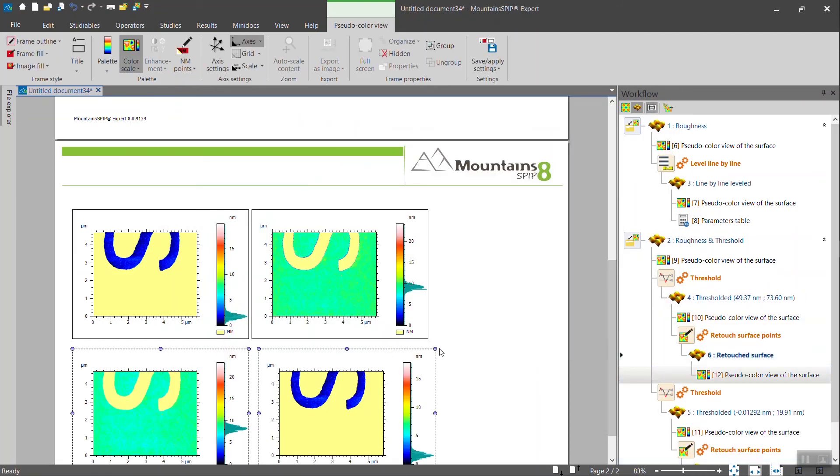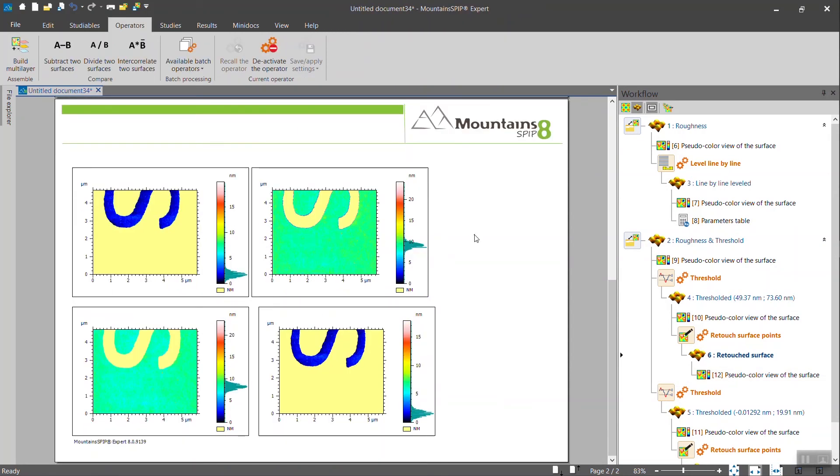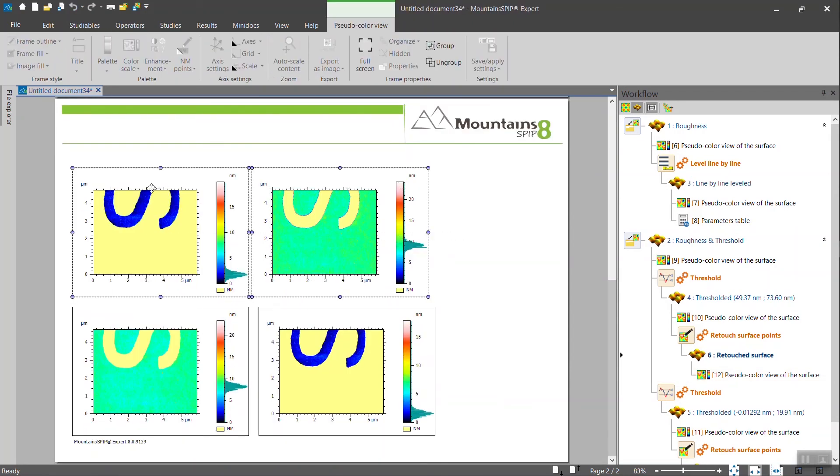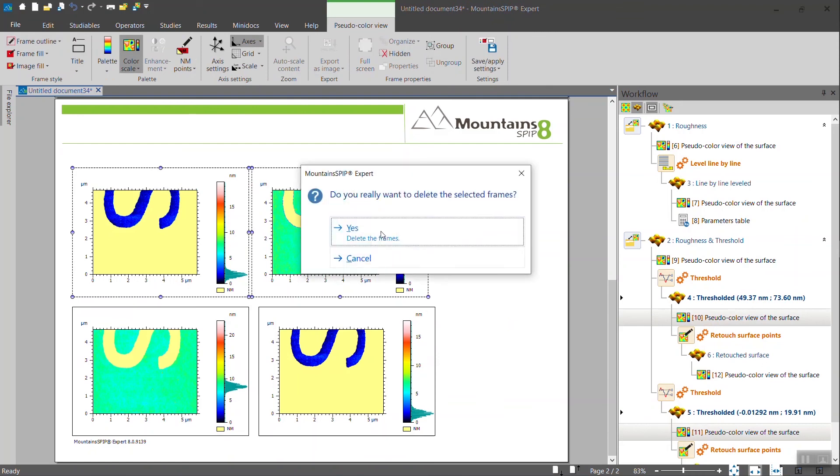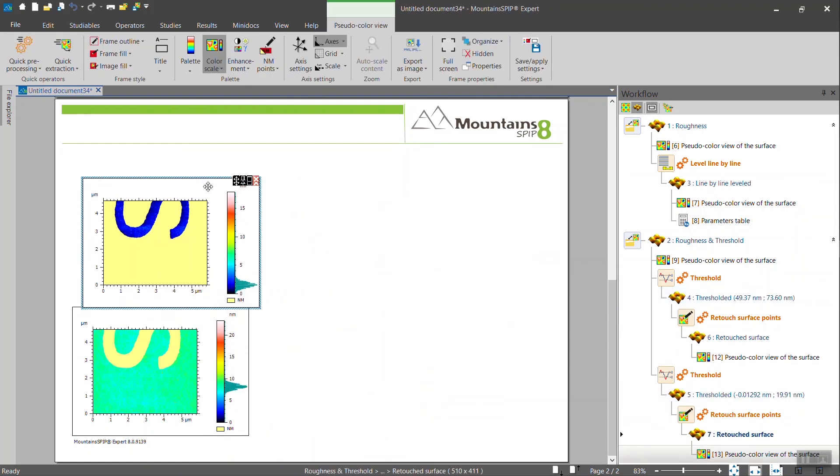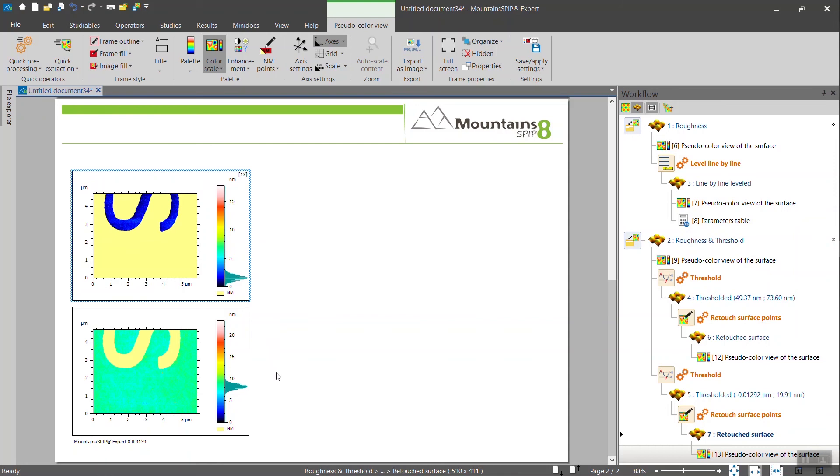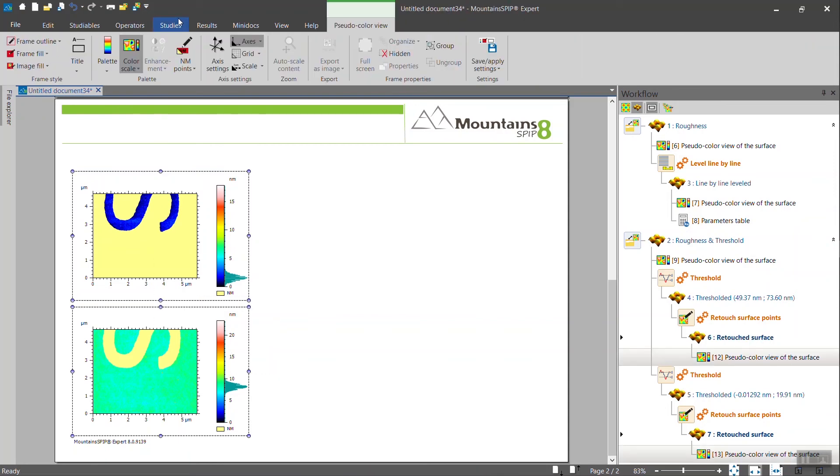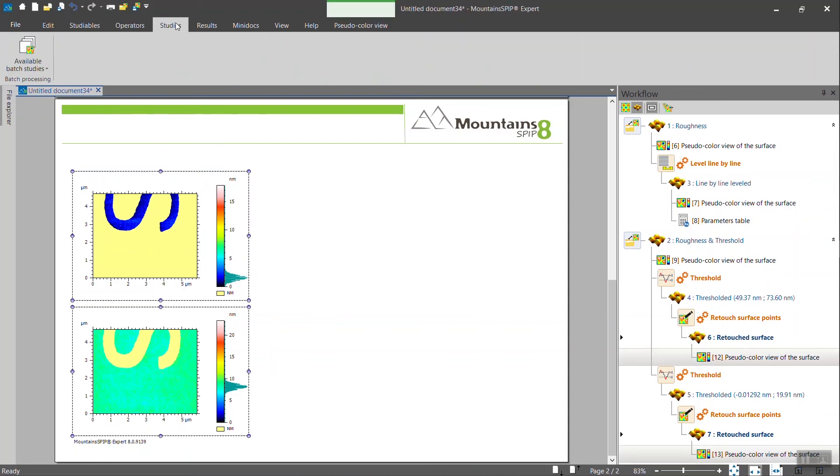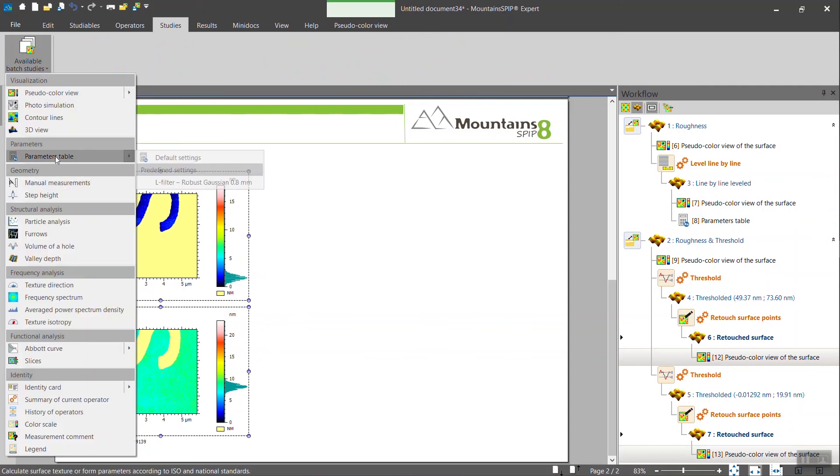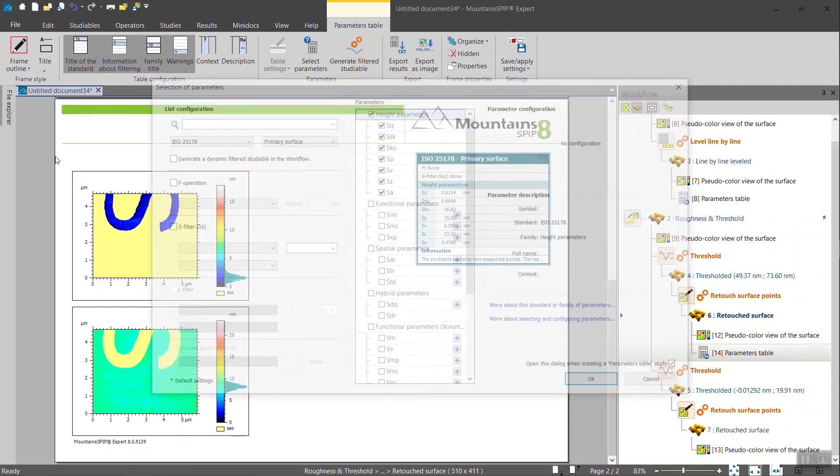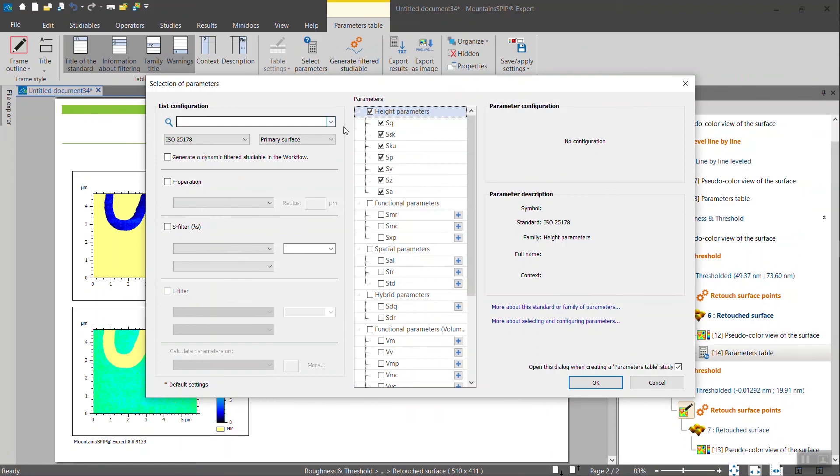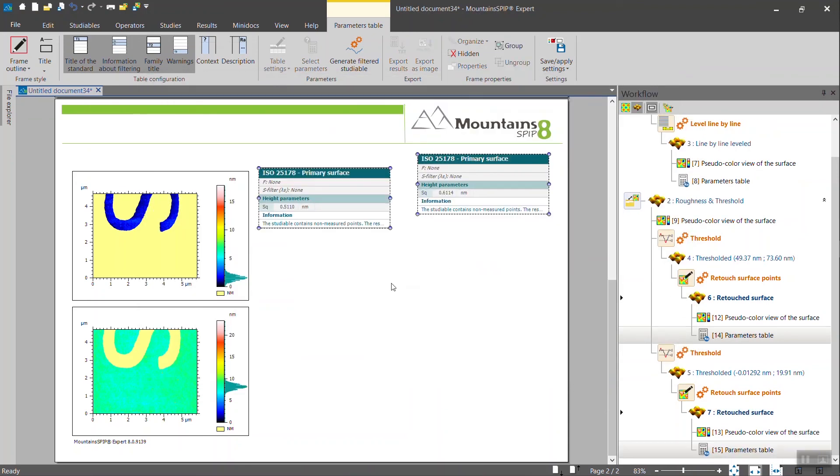And then the operator has been applied on both layers. We can delete these. Now I can select the two layers, select studies and available batch studies parameter table. And I want to calculate the SQ parameters on the unfiltered surfaces. This time, select OK. And now I have the two.